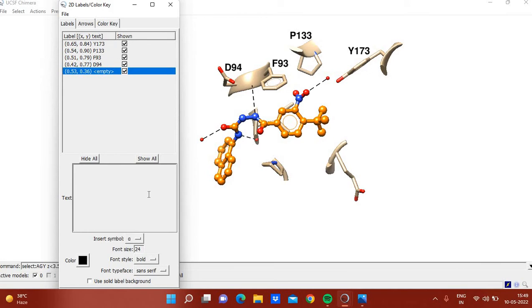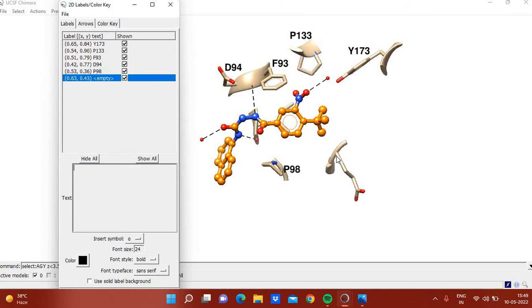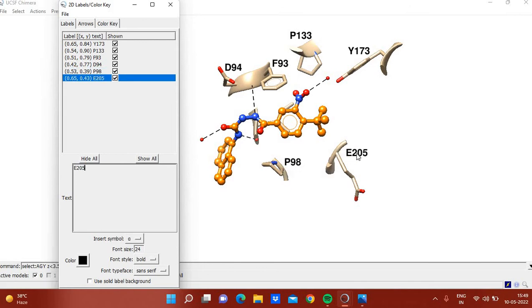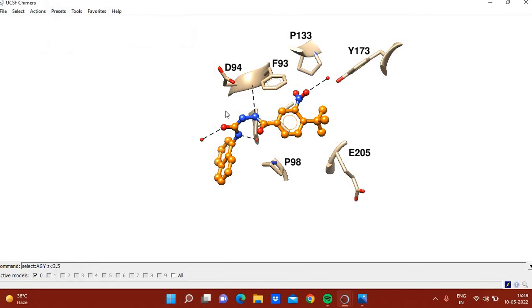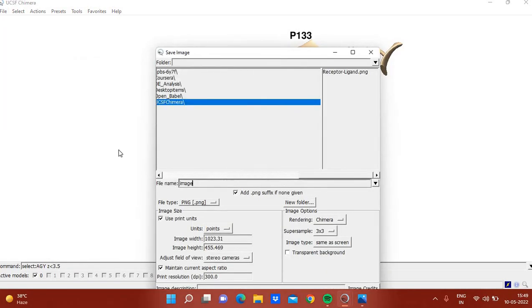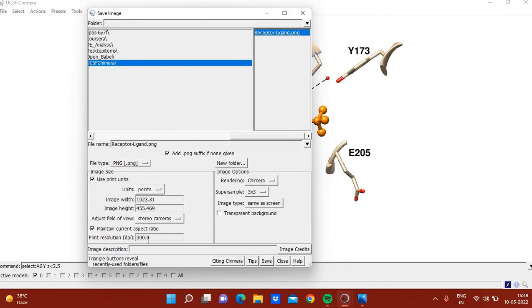Continue labeling other residues: F93, Aspartate D94, and D205. Place labels so they are not too crowded. Once all residues are labeled, save the image using File > Save Image as 'receptor_ligand.png'. You can set the DPI to 300, 400, or 500 — 300 DPI is generally sufficient — then click Save.